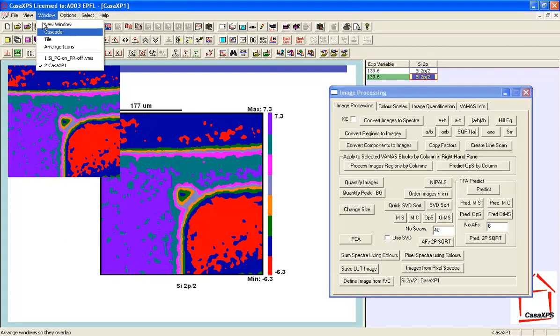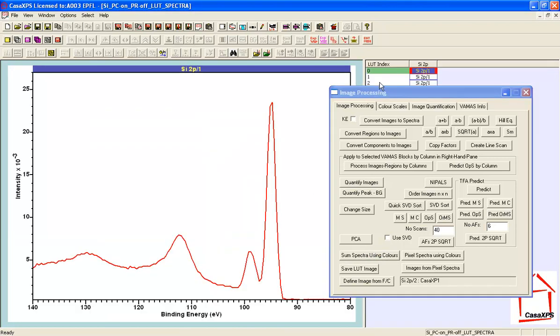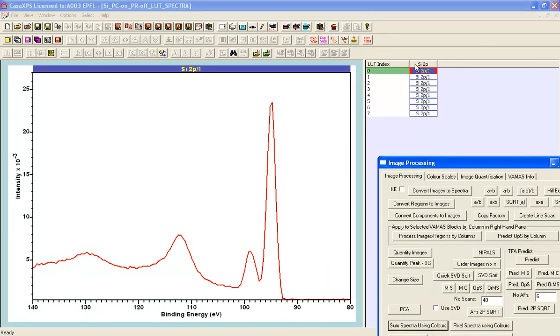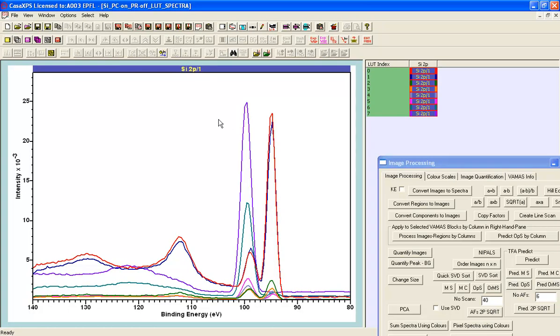Moving to the file containing the images, I converted these back to the raw image data so that when I add the pixels together I'm using raw intensities — not processed intensities. This is important because it means I'm taking the spectra with the counting statistics defined by these images. I press the sum spectra using colors button and end up with a set of false color spectra, one for each color in the lookup table 0 to 7. When I overlay these, they are displayed with the same colors used in the false color image, so I can identify each spectrum with its corresponding color.